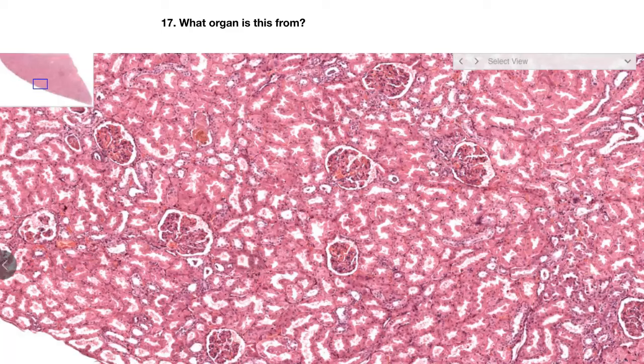Number seventeen. Looking at this slide, what organ is this from?